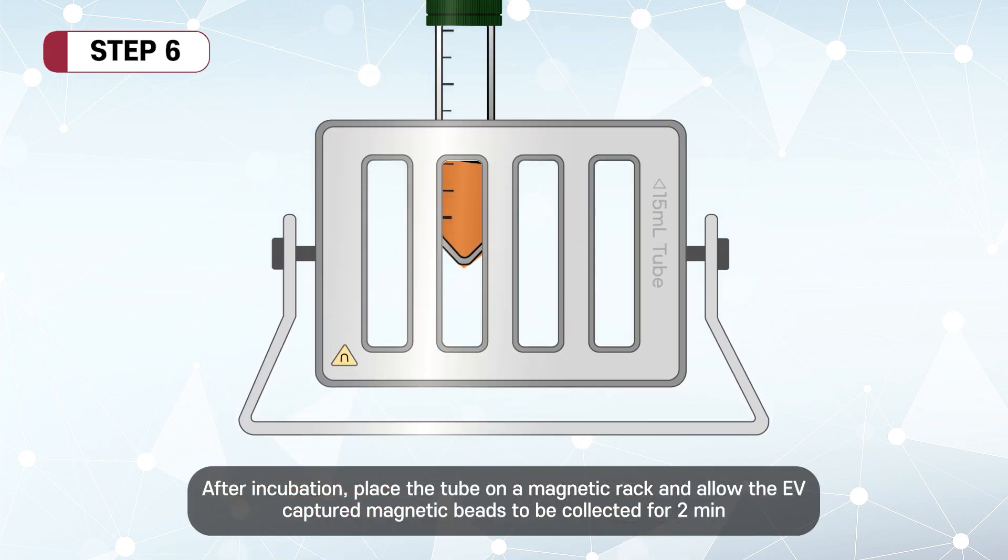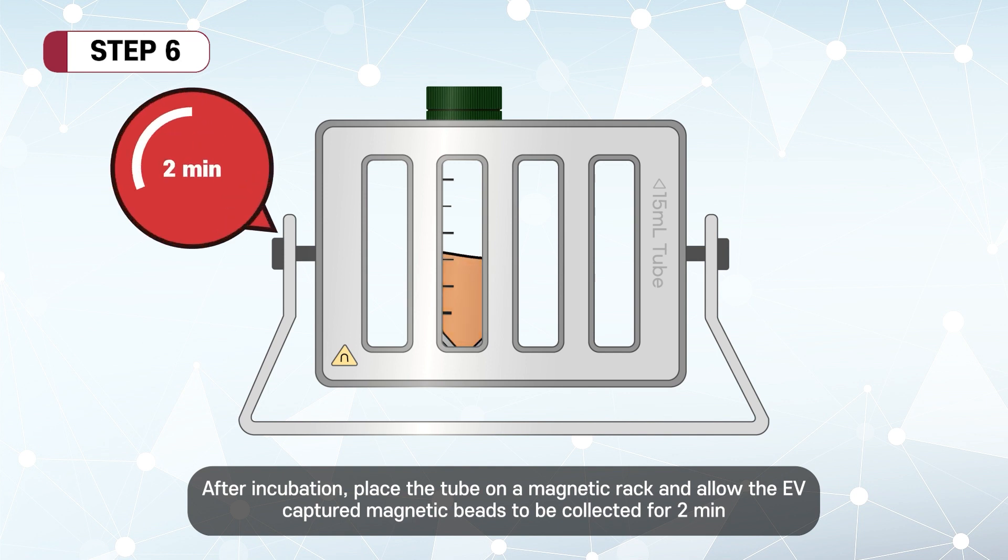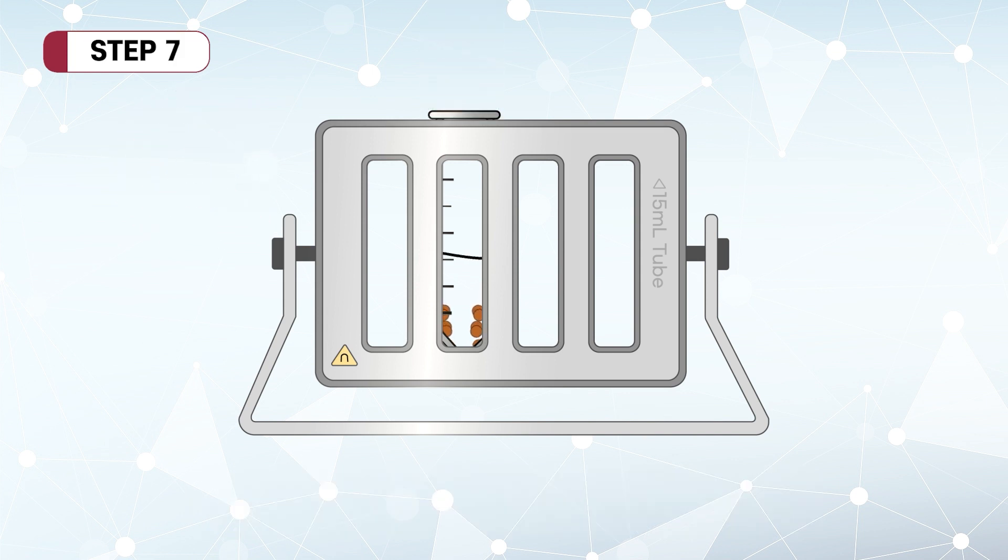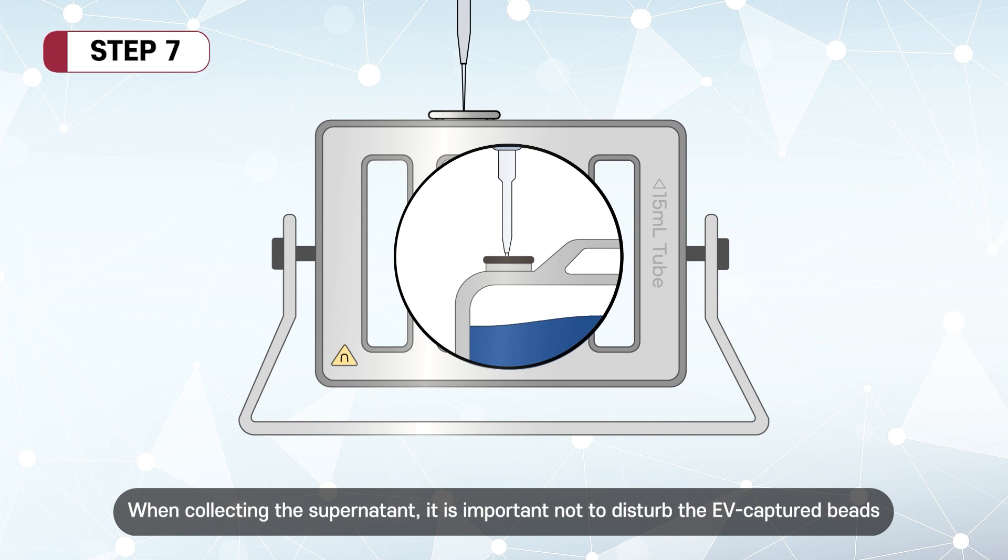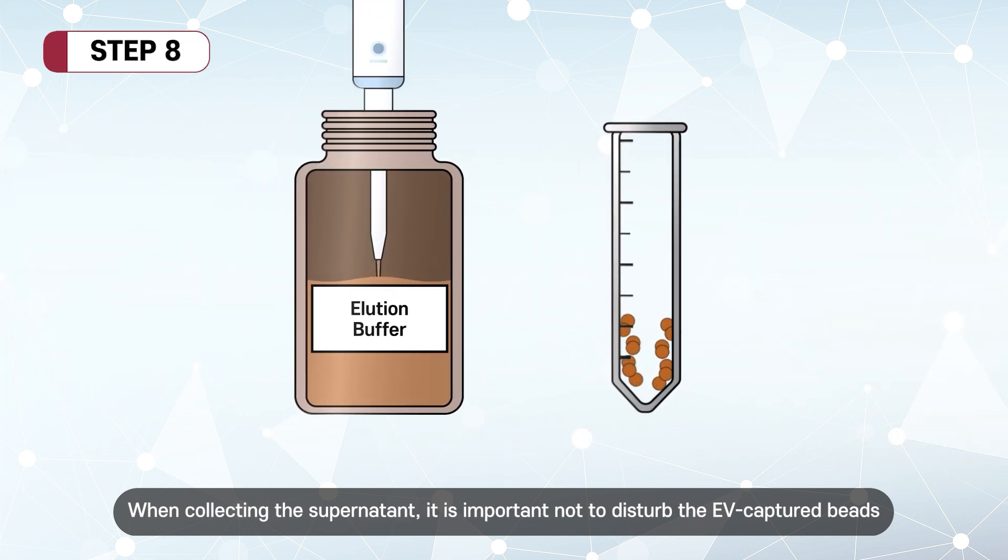After incubation, place the tube on a magnetic rack and allow the EV-captured magnetic beads to be collected for 2 minutes. Remove the supernatant in the tube. When collecting the supernatant, it is important not to disturb the EV-captured beads.